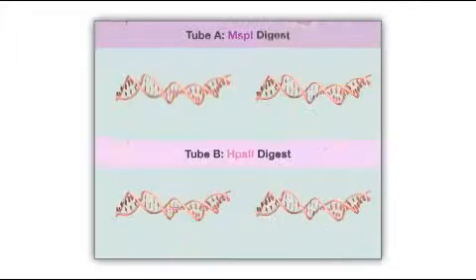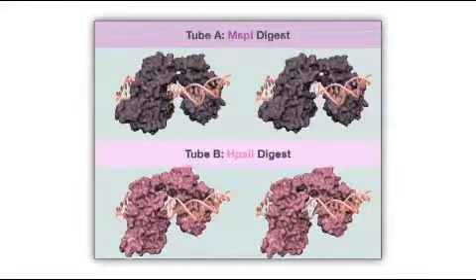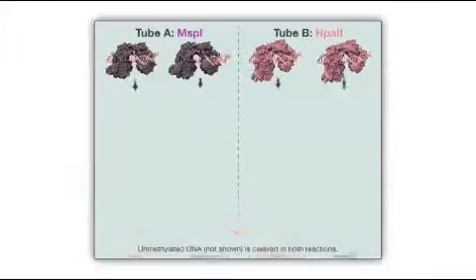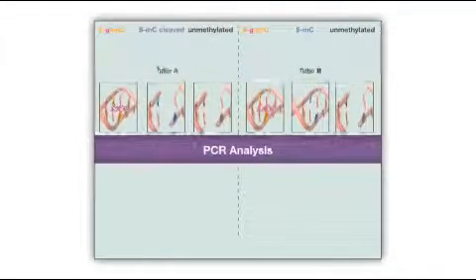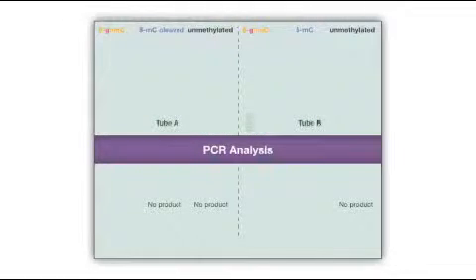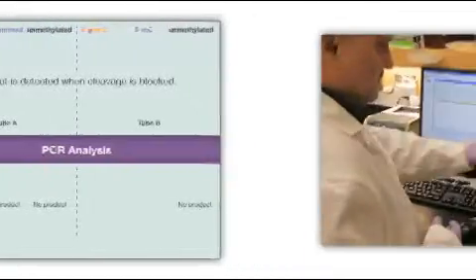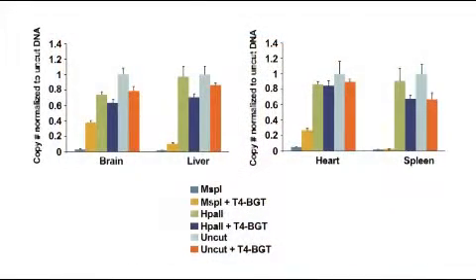As a second step, the genomic DNA is digested by the restriction enzymes MSP1 and HPA2, which utilize their differential methylation sensitivities to identify glucosylated 5-hydroxymethylcytosine sites. Next, PCR is used in order to interrogate the locus. Results are obtained that show the presence of 5-hydroxymethylcytosine in a specific locus. qPCR can be used to quantitate the amount of 5-methylcytosine and 5-hydroxymethylcytosine.